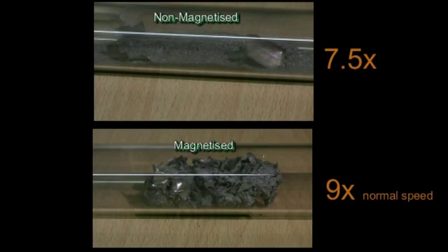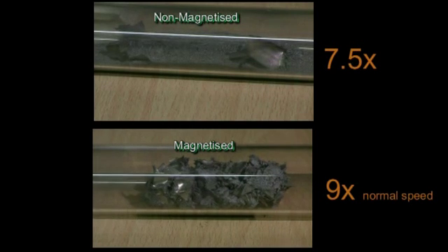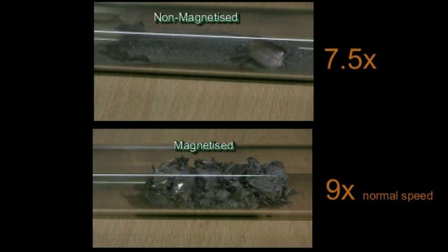It is also possible to see, on the top sample especially, that the corrosion protection coating, initially on the surface of the magnet, is not reacting with the hydrogen, and is effectively being peeled off.